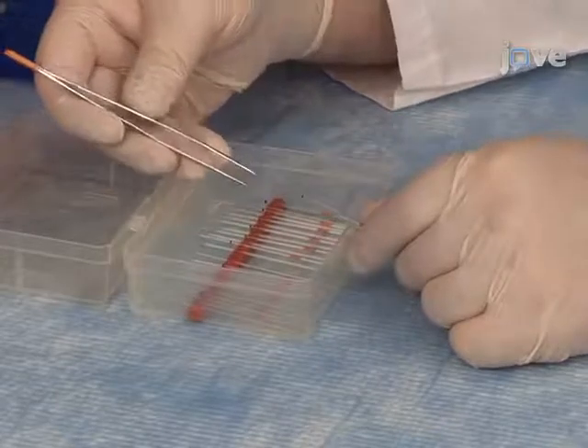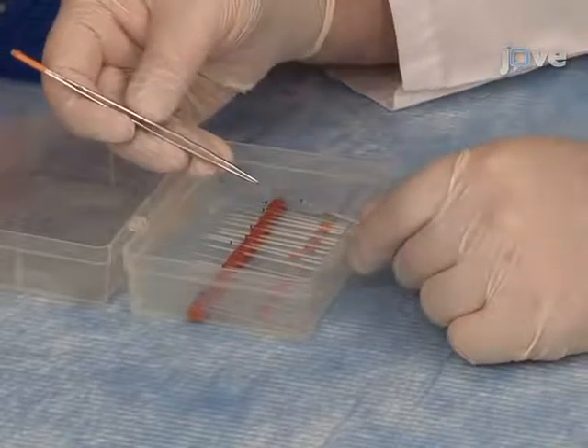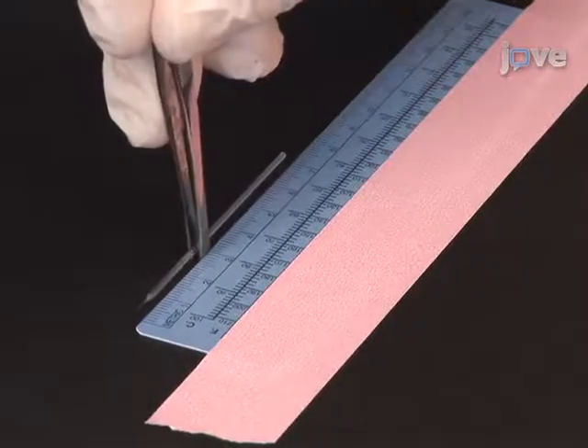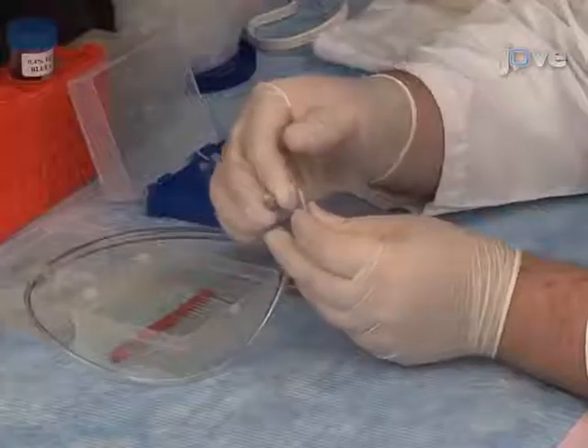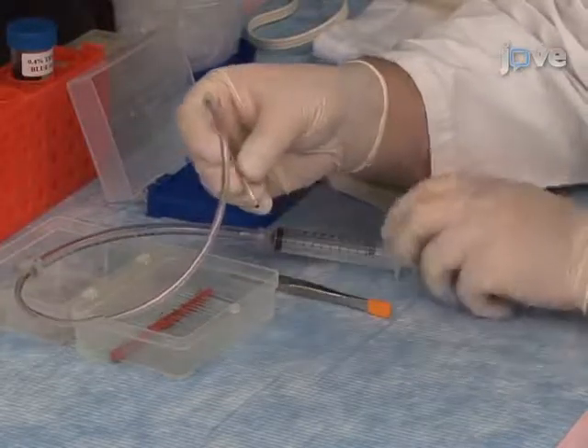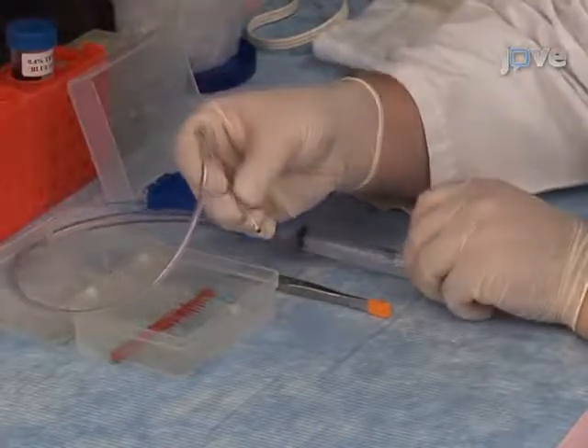Using flat-end tweezers, break off the tip of the glass needle so that it's 3 mm long. This will allow at least 2 mm penetration into the brain. Carefully load the solution to be injected into the glass micropipette needle by placing it diagonally in the microcentrifuge tube and pulling on the syringe plunger. Stop.